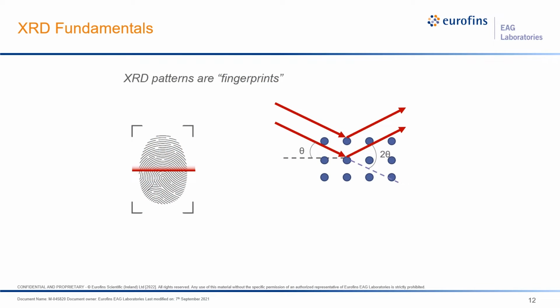And how does it study those materials? Well, as we saw on the last slide, crystalline materials are made of atoms arranged in certain ordered configurations with specific spacings. XRD reads this information like a fingerprint. X-rays are scattered off planes of atoms, and the interference of those scattered X-rays produces a pattern that provides a wealth of information about the atomic structure.